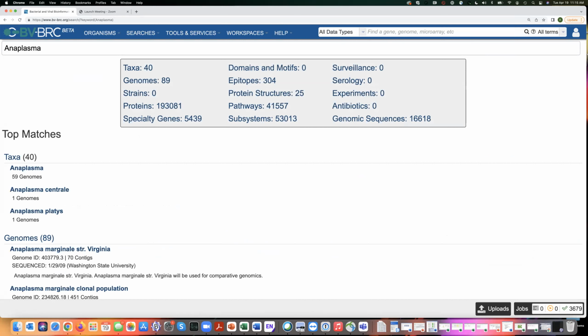Their question is, when you were looking at the Coxiella genomes, they thought they noticed that 20 of the 21 were poor quality? Yes. What does that mean? Maybe you can expand on that.